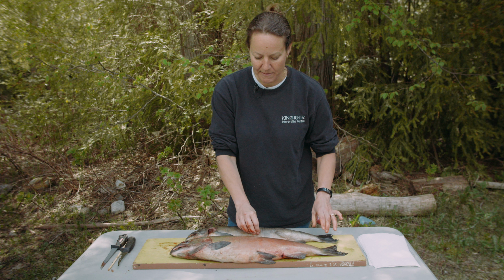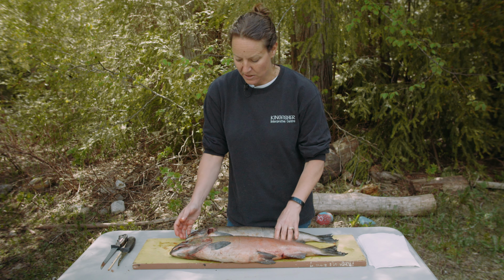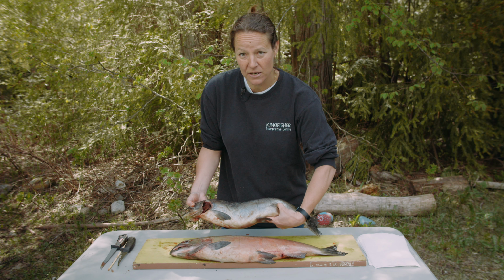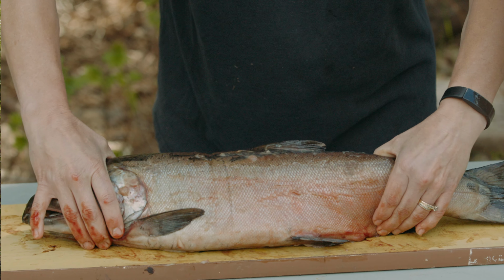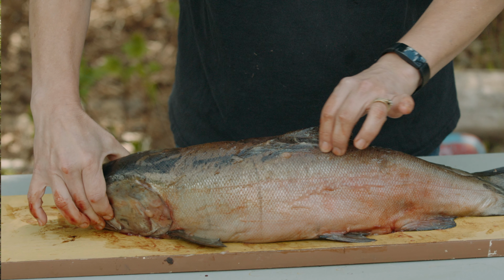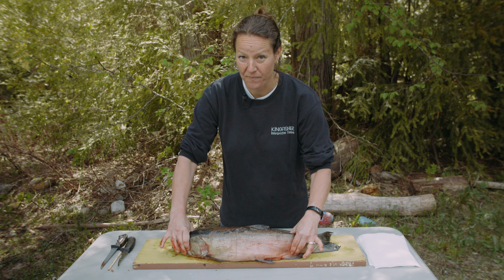Okay, another difference between these 2 fish, and this has nothing to do with whether they're boys or girls, is the color. So the fish we looked at yesterday is quite shiny, it's silver. This fish would have been caught closer to the ocean. This fish, you can see, is starting to change color. So you can see the red coming in here and the green starting to show up in its back. So this fish was closer to spawning.